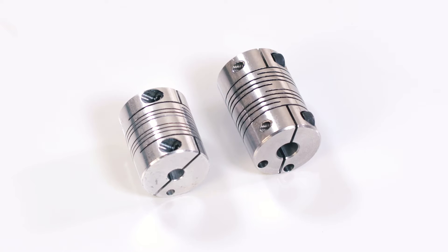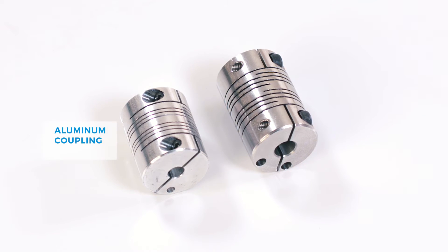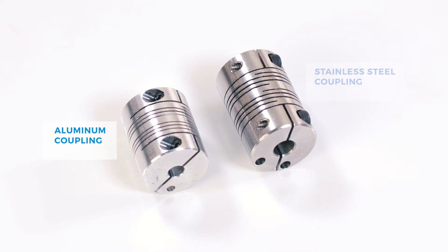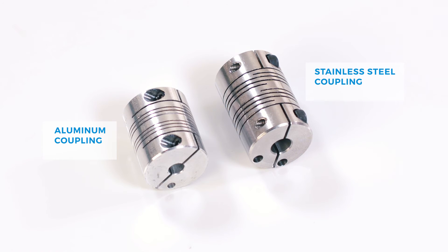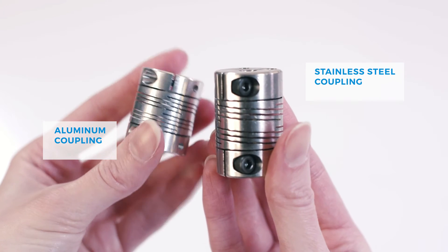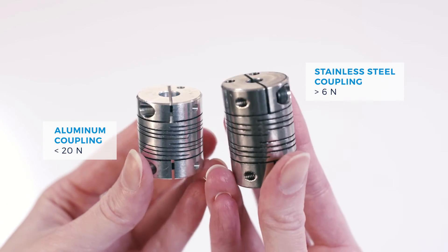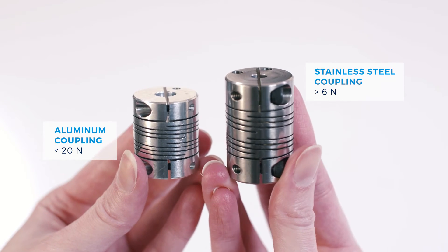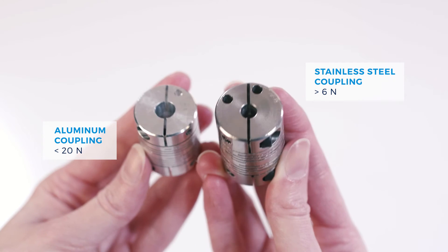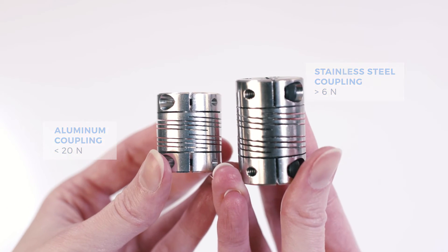In the geometry kit, there are two beam couplings: the aluminum coupling and the stainless steel coupling. Those couplings are used to provide excellent alignment between the two surfaces and ensure a uniform distribution of the axial force during the measurement. In general, the aluminum coupling is commonly used for lower axial force testing and the stainless steel coupling is used for higher axial force testing.